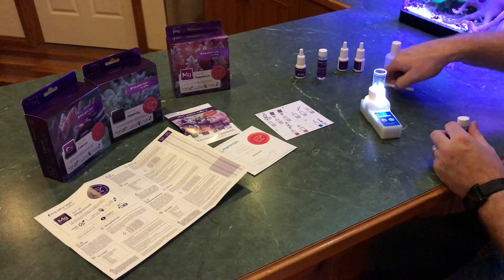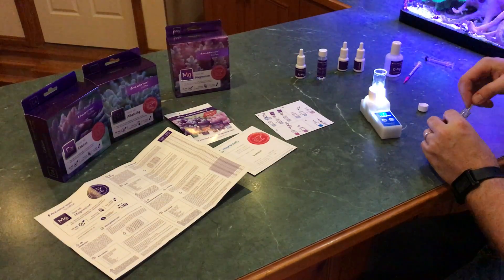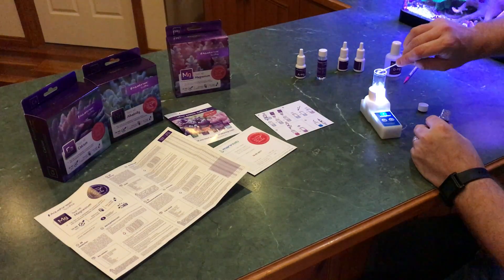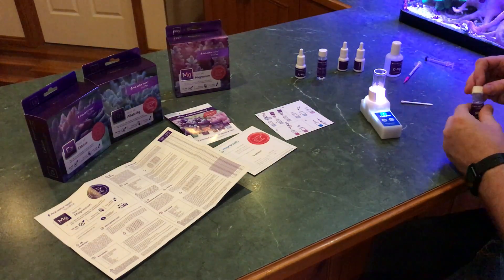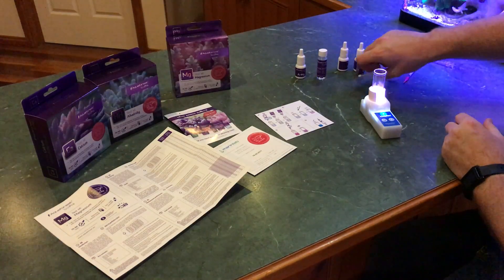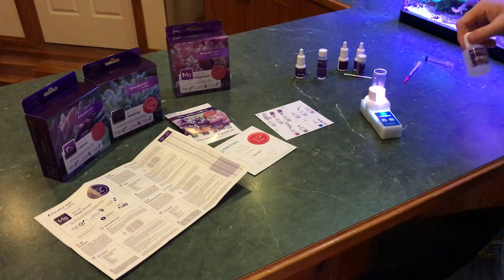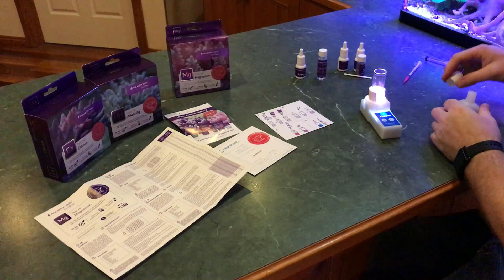Reagent C is next, which is a scoop of the powder. Probably don't need to shake that one because it's a powder. One scoop and in she goes. It says to stir for ten seconds — the speed stir does that pretty quickly. Then we get reagent D ready, which is the one you use your syringe for. Before I take the lid off I'll give that a quick shake as well.